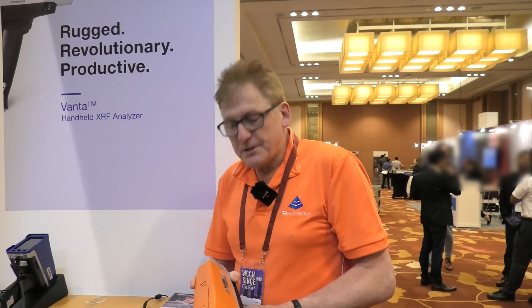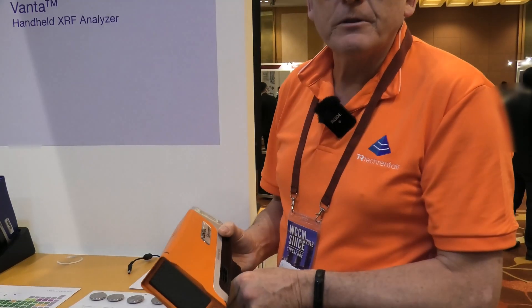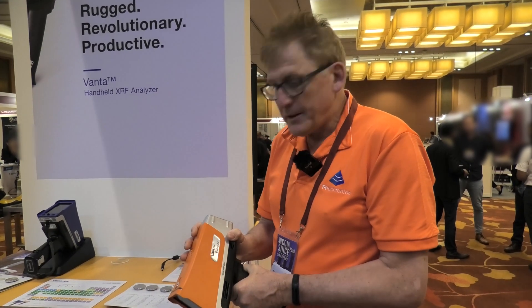Graham Murphy here at the WCCM, Product Manager at Tech Rentals. We're just going to have a look around at a couple of instruments. We're looking at the Vanta Element, which is an Olympus instrument. It's a positive materials identification piece of equipment. It's very effective.